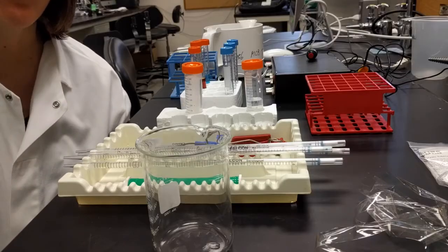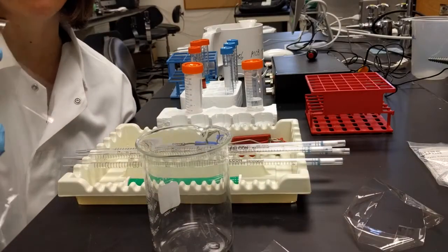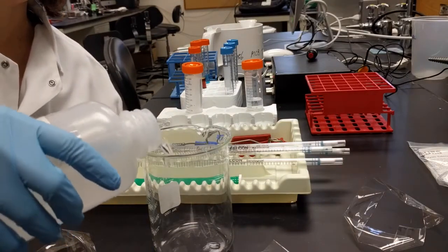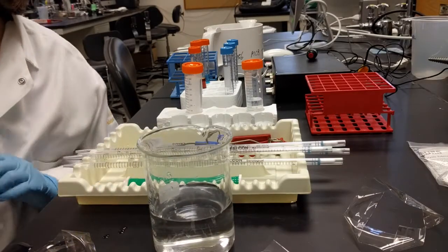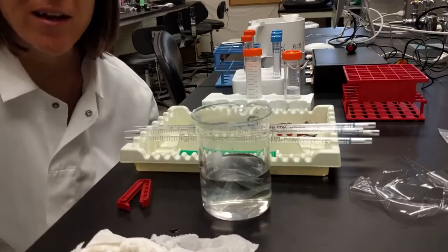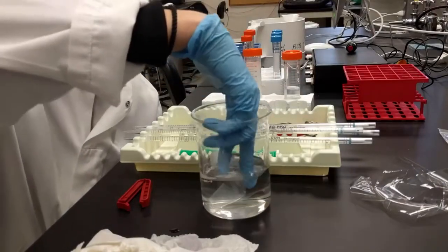All right, the first thing we need to do is take our dialysis tubing and get it wet so that we can open it up. So I'm just gonna pour some water into this beaker and let the dialysis tubing soak for a while. All right, it's been a couple of minutes, so the bag is ready now to be opened. So I'm gonna take it out of the water.